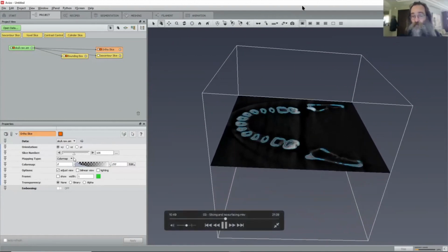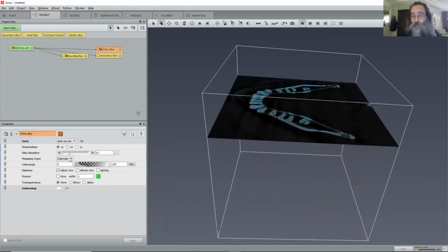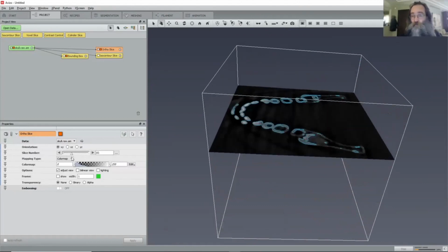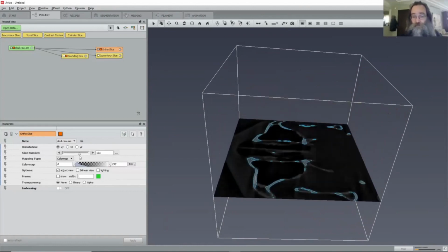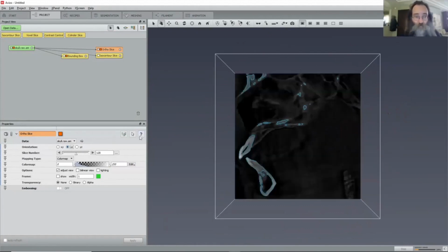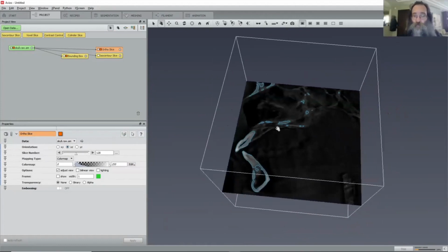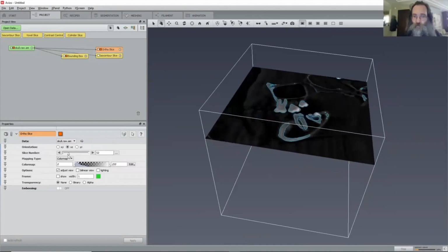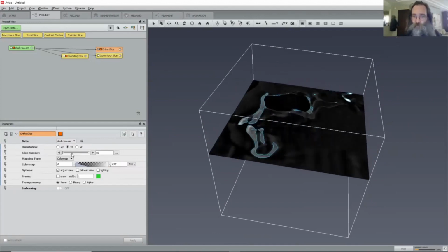And here you see the teeth. It's actually a good exercise trying to visually or mentally visualize how this would look like. It's not an easy task. We'll use Avizo later in a minute to do that explicitly. And do it in a different direction. Maybe rotate again a bit so you see it. And see where your contours and where your 3D object will be.